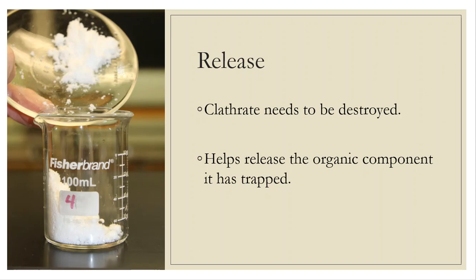Okay, so now I'm going to take all of those clathrate crystals, and I need to dissolve those. So I'm going to transfer those. Yes, I know, another transfer. I'm going to transfer those again to a beaker. And that beaker is going to get some solvent that's going to dissolve those crystals up for me. So that's why I'm having to transfer it over once more.